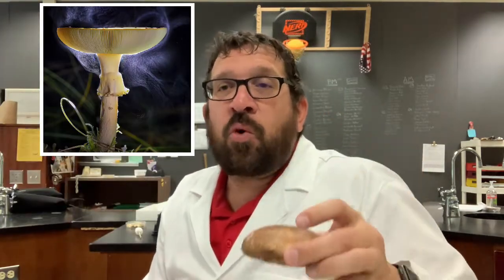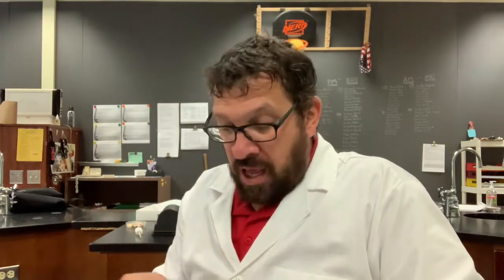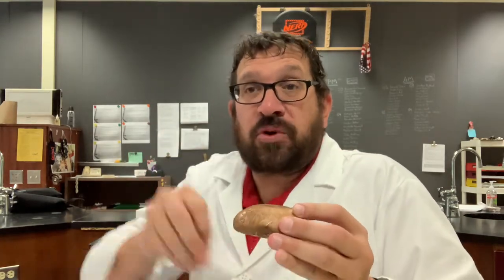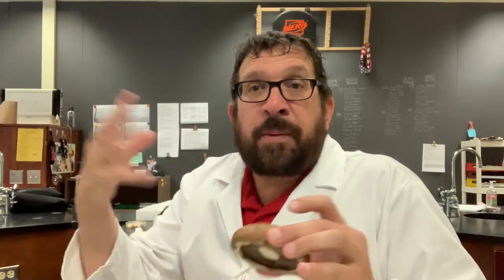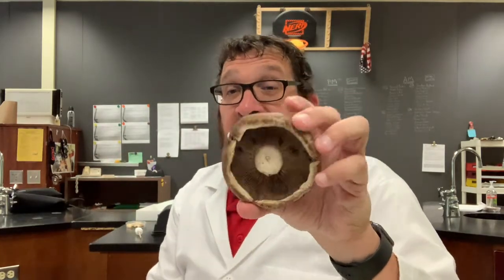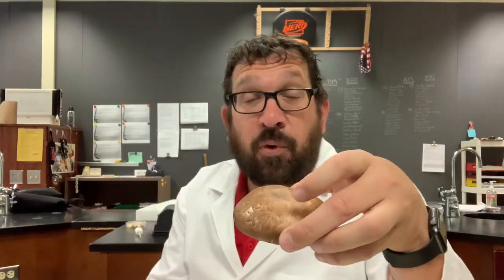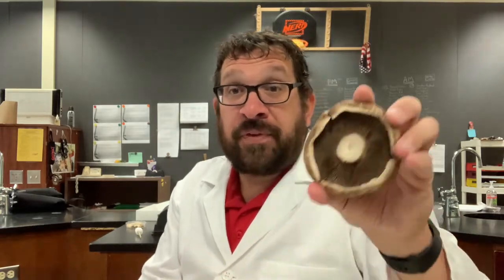Because organisms don't want to compete for the resources around them. They don't want to compete for the food or the water that's around this mushroom. This mushroom wants its spores to get lost, go somewhere else in order to reproduce and grow somewhere else. So that way, a mushroom like this that could have possibly 40 million spores in it doesn't drop 40 million mushrooms underneath it, and hopefully, because those mushrooms would take over all the other resources around. So let's get into taking a look at these gills.